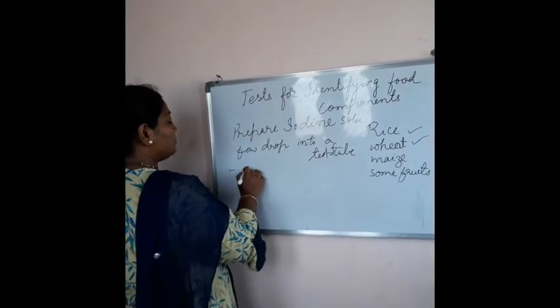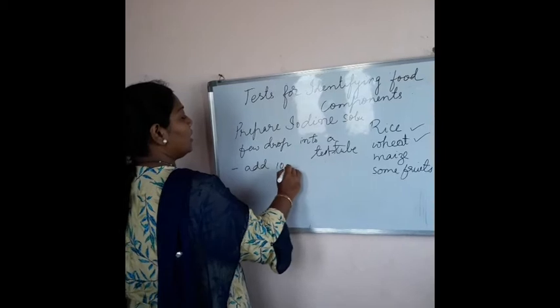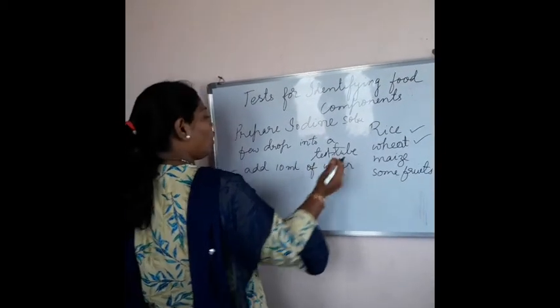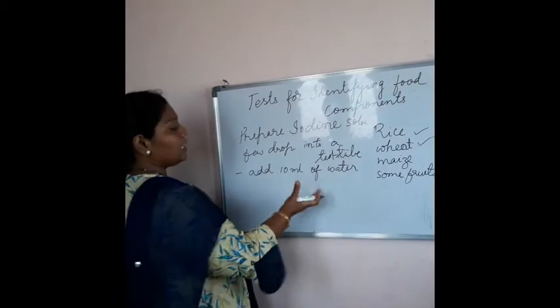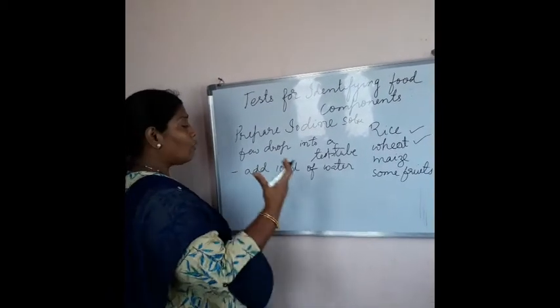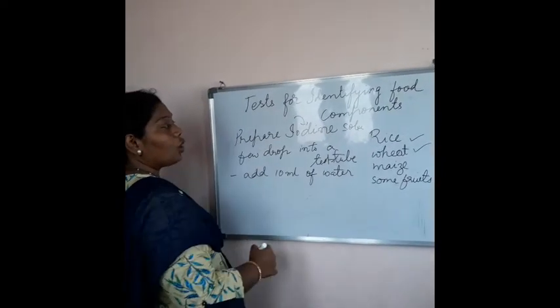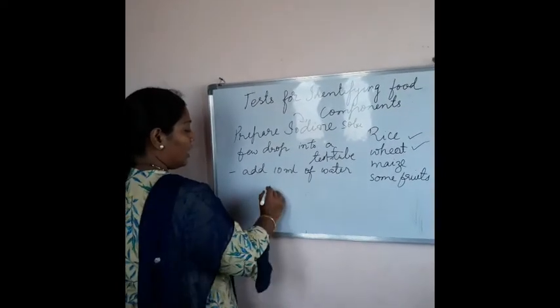Now add 10 ml of water, or you can add water to dilute this iodine solution. You have to dilute the iodine solution.